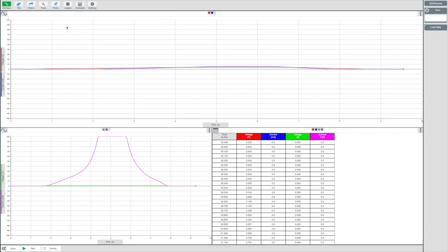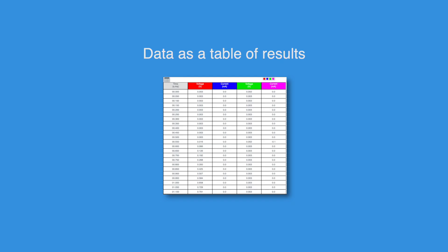Within the EasySense 2 software, you can also present your data as a table, showing the information as rows and columns as you would expect to see in a spreadsheet application like Excel.